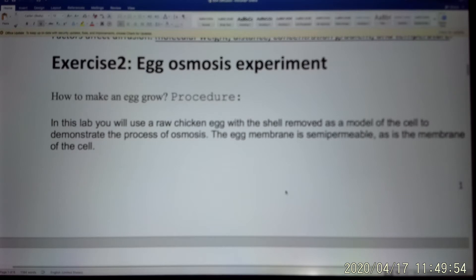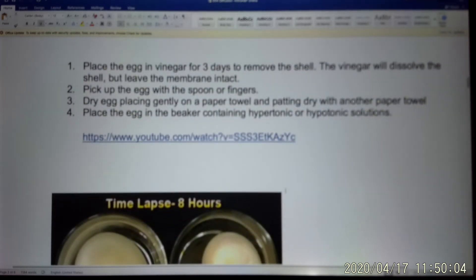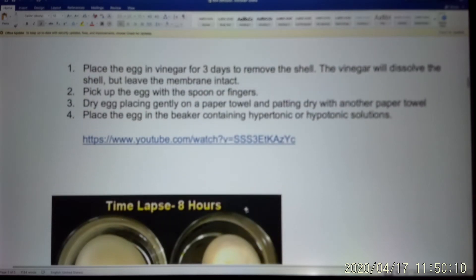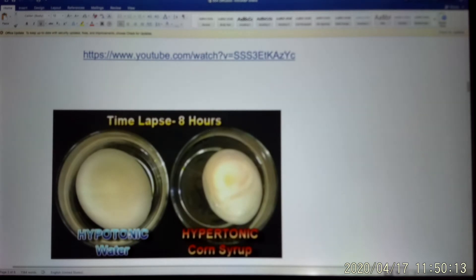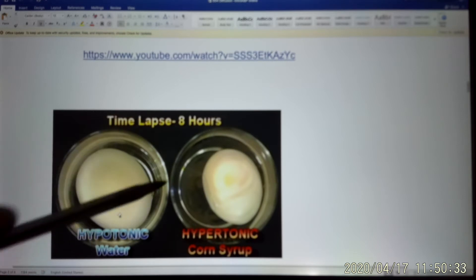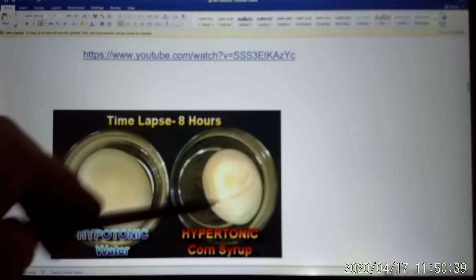To make the raw egg grow, you put it into a hypotonic solution. First you need to put the egg into vinegar for about three days to remove the shell — the vinegar eats away the shell. After three days, you can put the egg into a hypotonic solution like pure water. If you put the egg into pure water compared to a hypertonic solution, you find that water keeps moving in to dilute the egg. The hypotonic solution makes the cell swell. And if you put the egg into a hypertonic solution like corn syrup, the cells are going to lose water and shrink.